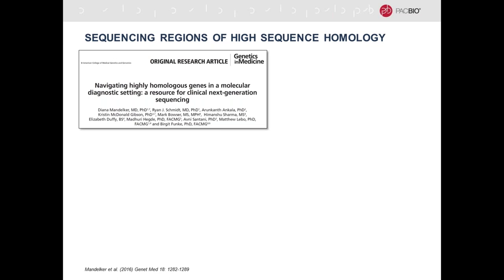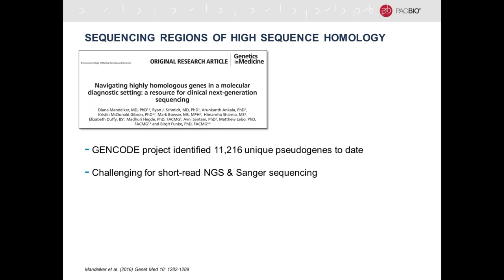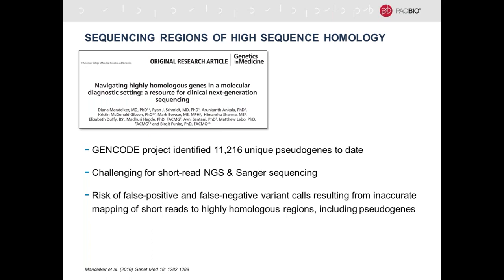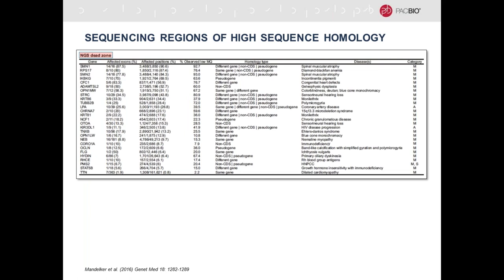The GENCO project identified well over 10,000 unique pseudogenes to date. Pseudogenes tend to be challenging for short-read NGS and even Sanger sequencing because of their high similarity to the corresponding gene, creating a risk of false positive or false negative variant calls resulting from inaccurate mapping of short reads to highly homologous regions. In this review paper, there are tables calling out 'NGS dead zone' genes linked to known diseases that are very difficult or impossible to address with NGS—many because they have pseudogenes. There are 193 medically relevant genes in the so-called NGS problem list from this paper.